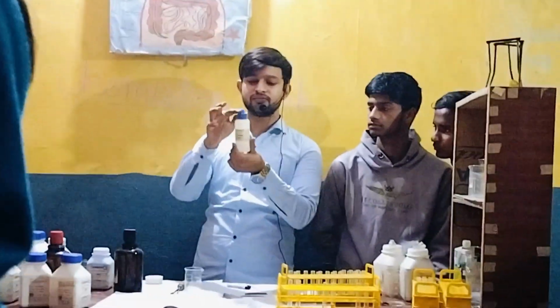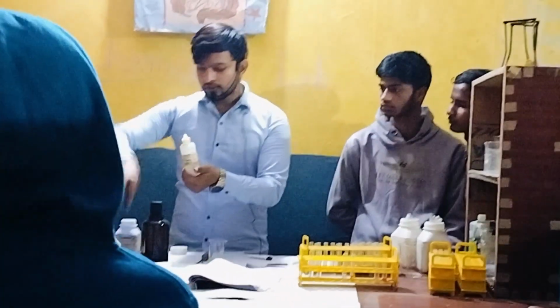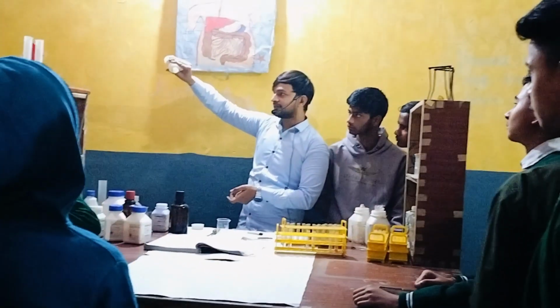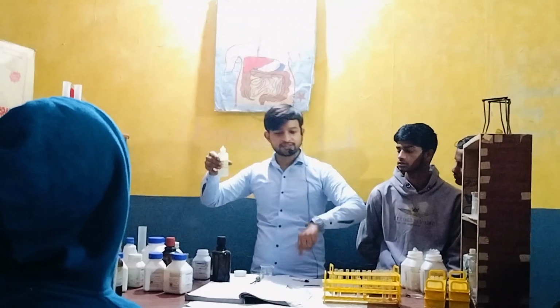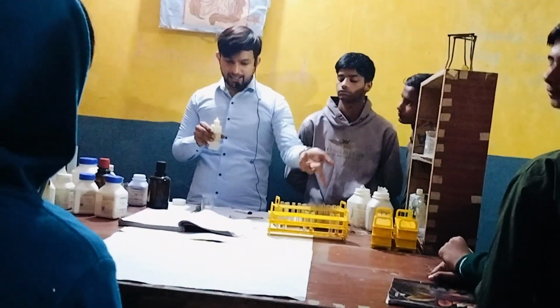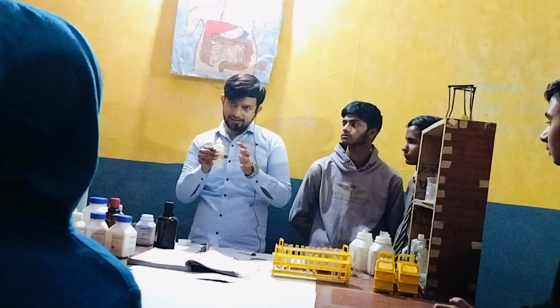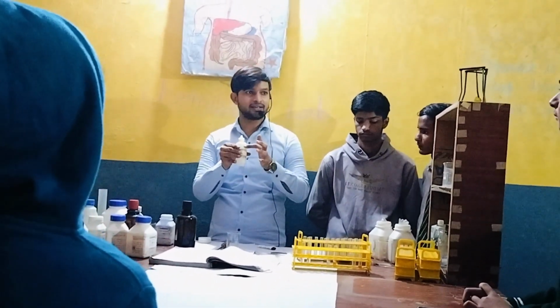Okay. Now let's perform the experiment with phenolphthalein. Okay, please observe. Everyone, please see here. See, the color of phenolphthalein is white. Now see the experiment. When I add the droplets of phenolphthalein into acid, then no color will change. Okay, but when I add this into base, it will change into pink color. This white color will change into pink color.